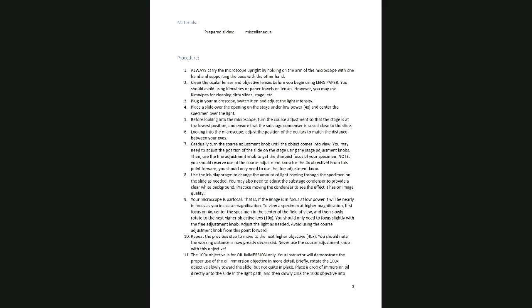Now, if the oil lens still keeps hitting the slide, the most common explanation for that is because your slide is upside down and the specimen is pointing towards the ground. And that does happen frequently, especially with students making their own smears. A really thin smear, it may be hard to see on which side it is. And so students accidentally flip the slide over when they put it on the scope, and you can focus on bacteria which are on the bottom of the slide all the way up through high dry, but when you try to go to oil, you can't get close enough to focus because the specimen's upside down, the slide's upside down.